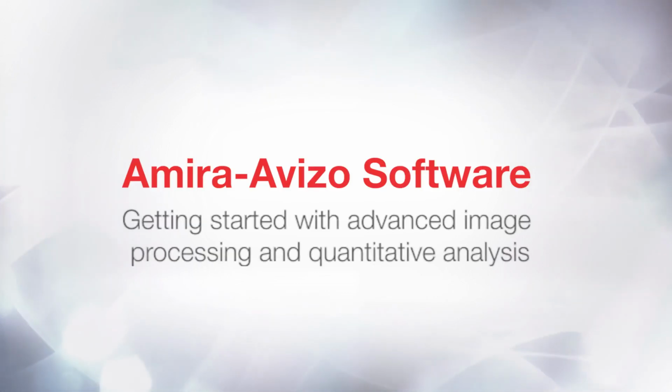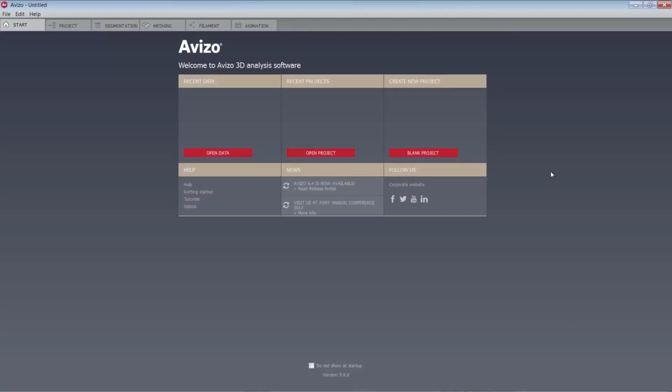In this step-by-step tutorial, you will learn the basics for using Amira or Avizo for image processing and analysis. The example used can easily be extended to other applications and follows a typical workflow of image analysis: image enhancement, feature extraction, and data measures and analysis.